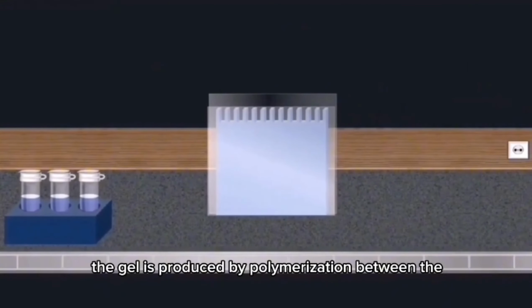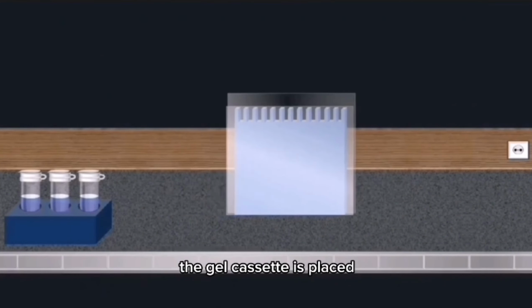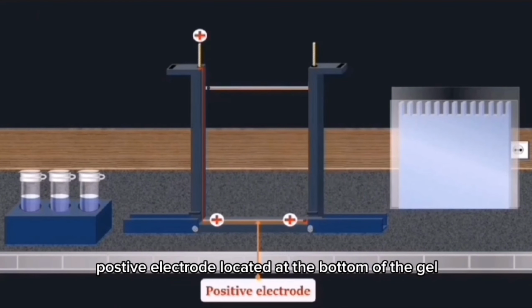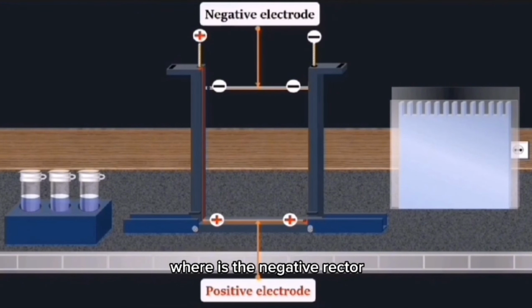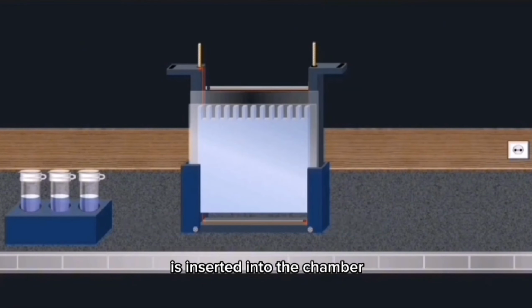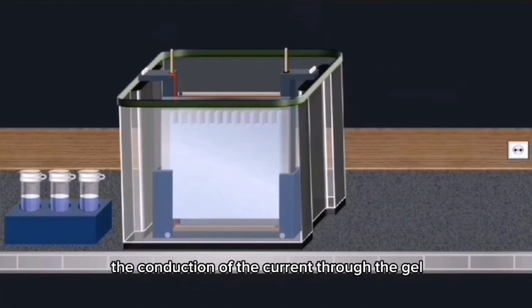The gel is produced by polymerization between two glass plates anchored vertically in a cassette. The gel cassette is placed vertically between two electrodes, with the positive electrode located at the bottom of the gel, whereas the negative electrode is positioned at the top of the gel. Next, the gel is inserted into the chamber. Then a running buffer is poured to allow the conduction of the current through the gel.